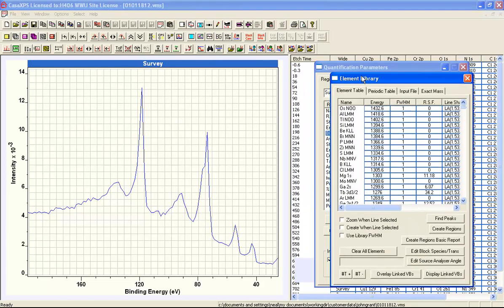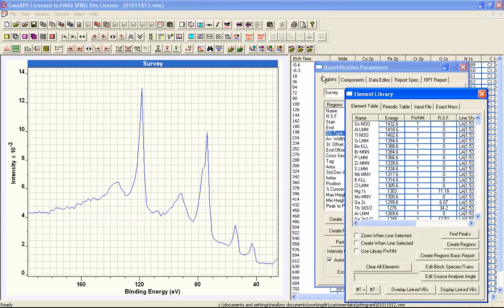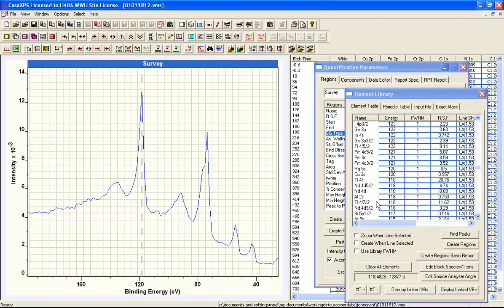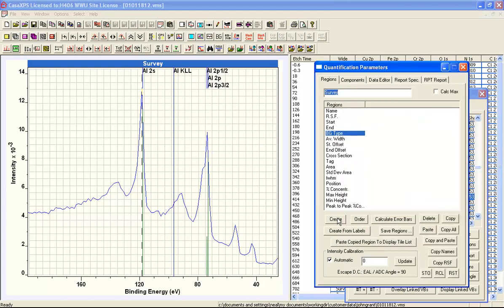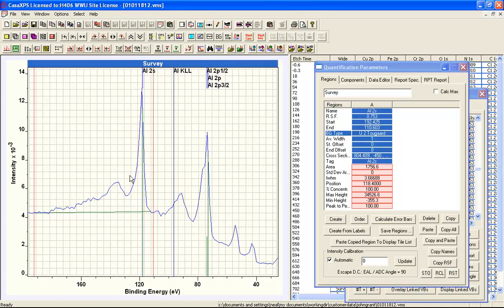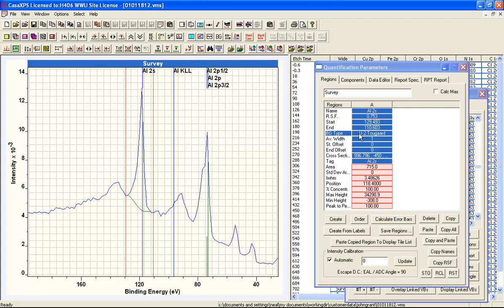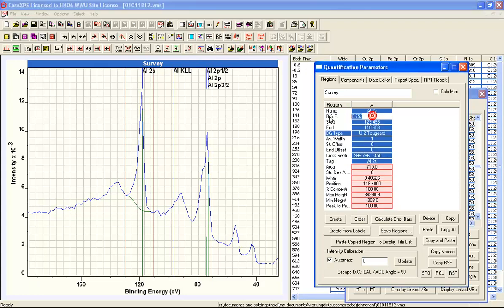If we bring up the element library and have the regions property page topmost, click where the peak is, and identify the peak, then if we press Create, a region is created with the background specified over an interval. The relative sensitivity factor is brought in using the line indicated in the element library. If this were aluminium alone, we could continue identifying other peaks and produce a quantification.